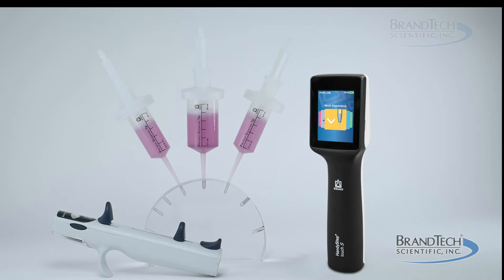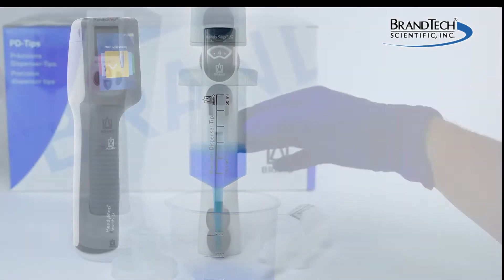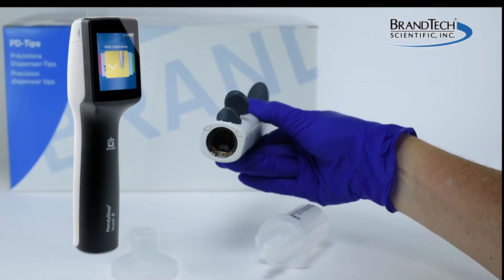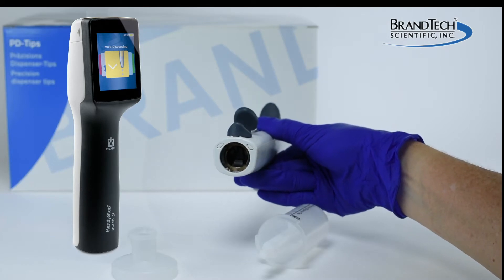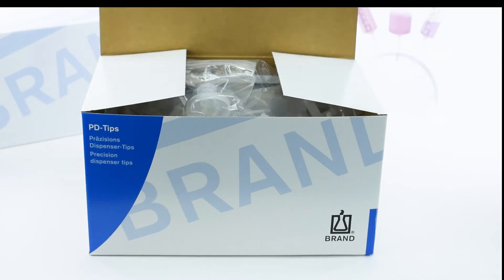25 and 50 ml PD tips require the use of adapters to attach them to the HandyStep S repeating pipette or other pipettes using standard repeating tips, as the diameter of the tips are larger than the fitting on the instrument. An adapter is supplied with every package of 25 or 50 ml PD tips.